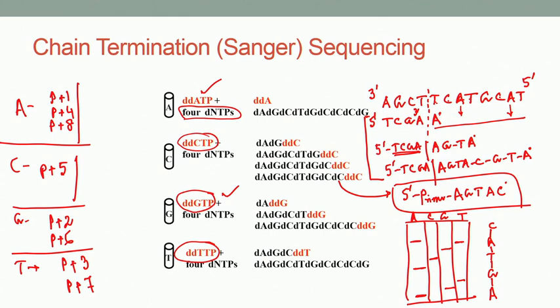strand of the DNA. So, that will be A, G, T, then A, then C, and then G. If you just continue, you will get that. So, that will be your 5 prime end and this will be your 3 prime end. So, basically you read the gel. It is very simple, reading the gel is not a problem.